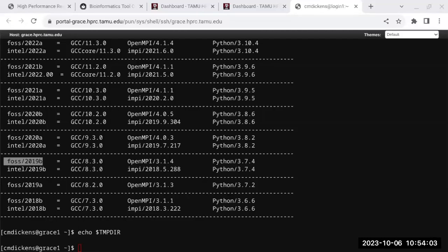And the way to do that is you don't want to just take the first 10% of the sequence files. You want to take a subset of that, and you want to do it across the genome, so you have a uniform coverage of 50x, for example. BBMap will handle that for you. Trinity does an automatic normalization now to 50x. So if you have 300x or 500x in your RNA-seq data, by default, Trinity normalizes to 50x because they recognize that you don't need 500x to do this type of assembly.